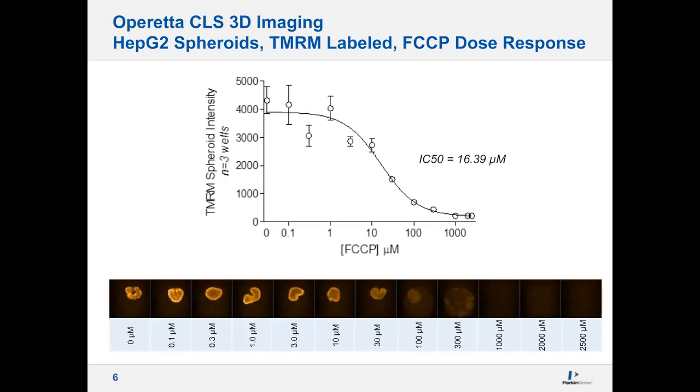We were able to take that data and generate a dose response curve, and the fit went pretty well. Again, these cells were challenged just overnight, so approximately 20 hours. You can see we have a nice dose response from which we can calculate an IC50, and this was an N of 3 different wells.